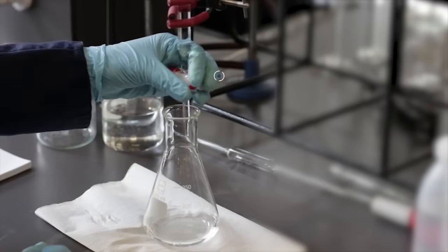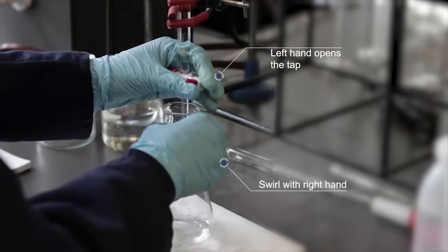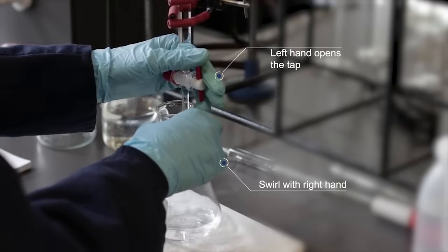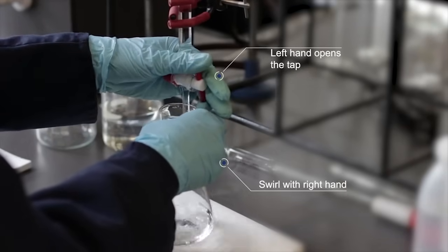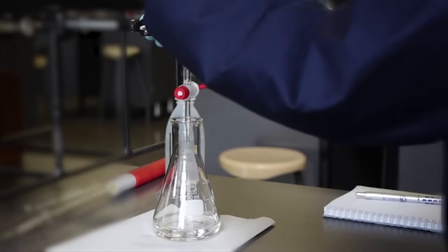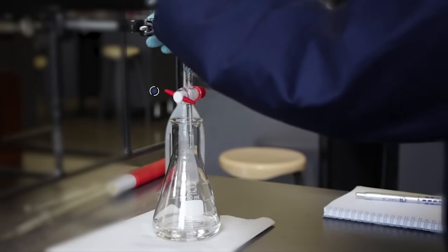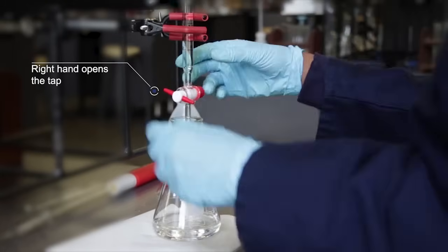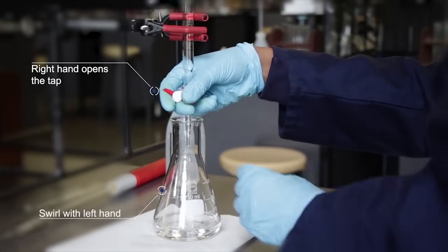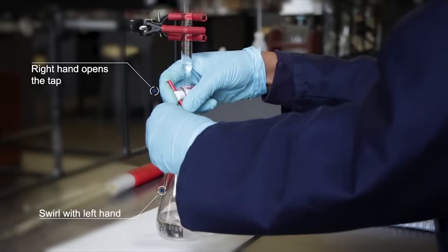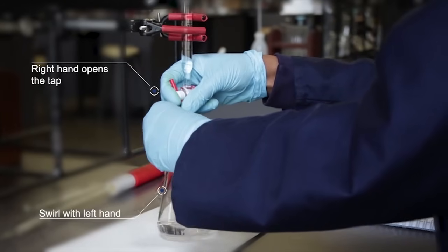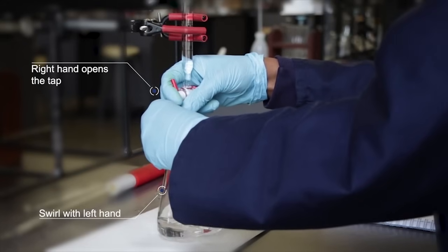For right-handed individuals, the burette tap will be handled using your left hand while the flask is swirled with the right hand. However, for left-handed individuals, the burette tap is handled with the right hand and the flask swirled using the left hand. In this case, the left-handed individuals will have to reverse the burette to accommodate their titrations.